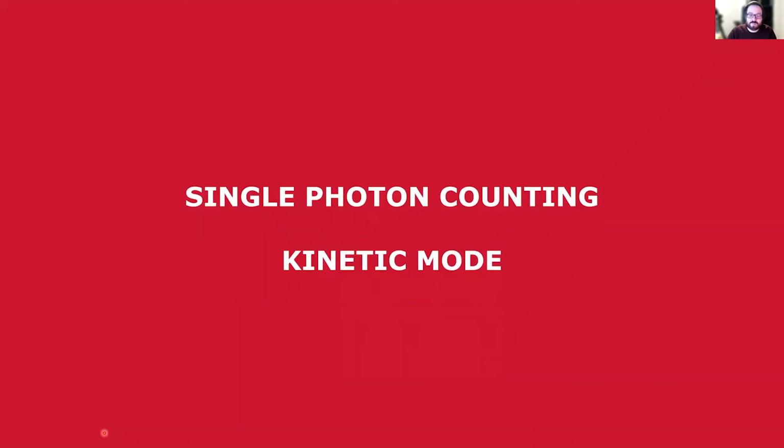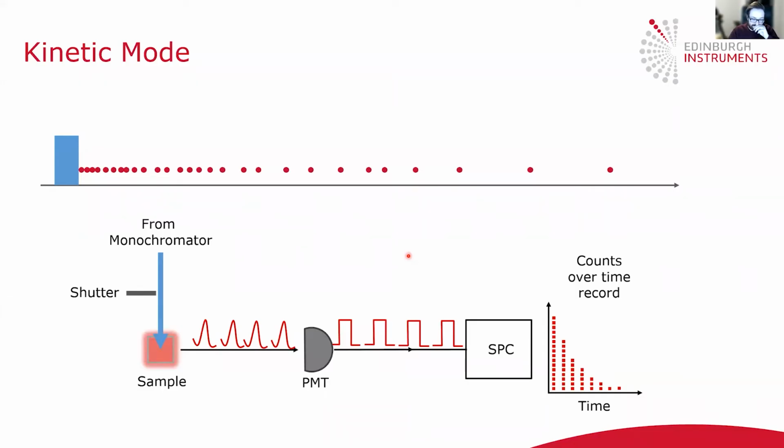The final measurement mode I want to talk about is single photon counting kinetic mode, which is used to measure the longest lifetimes. The idea of the experiment in kinetic mode is quite different to TCSPC and MCS.